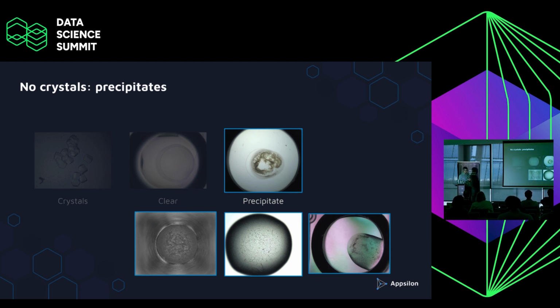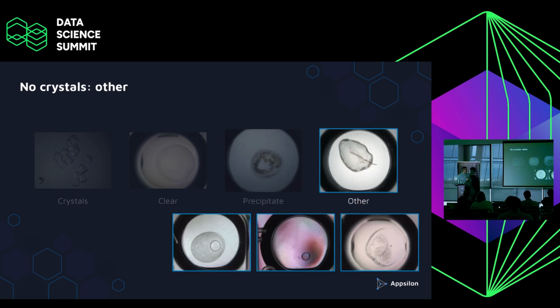And for me, many of them look identical to the crystal images. But they do not for the experts, and they have very different meaning for the drug discovery process, and hopefully they will look different for our models. And then there is also the other category, my favorite. In every computer vision project I've worked on, the other is always the fun part. There can be artifacts, maybe some dust, you can find anything there. So there are also those images that you need to deal with. Your model needs to behave well when it sees crazy stuff.